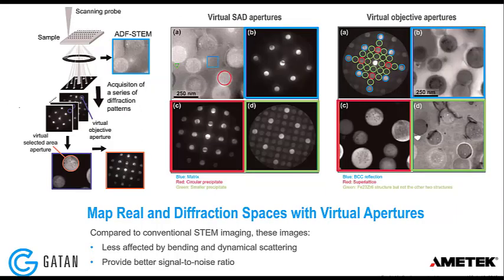The other one is being able to do virtual imaging. You saw this figure from Roberto. I have the reference down here. So the nice thing with using virtual apertures is that you can do things that may not be possible to do physically, designing virtual apertures that are not possible to physically make.